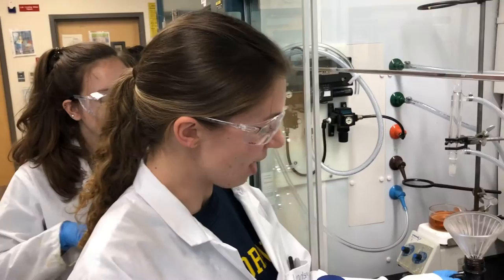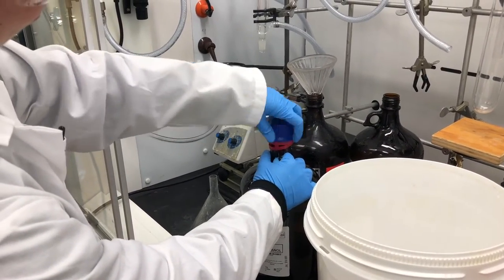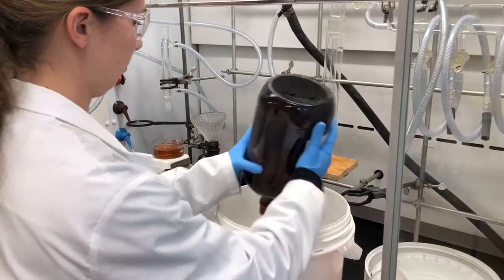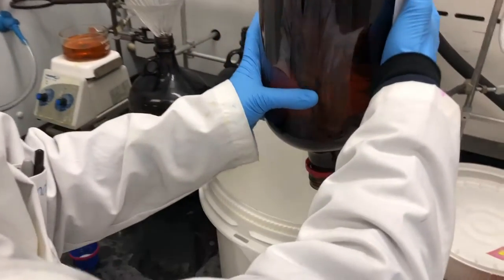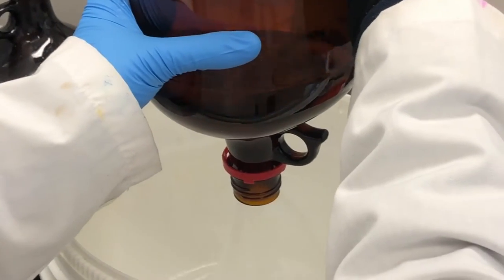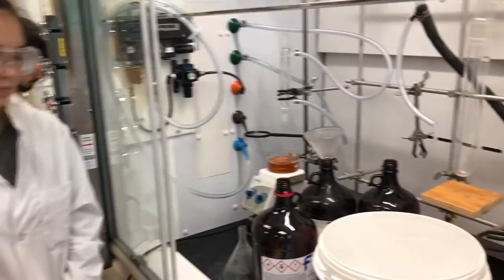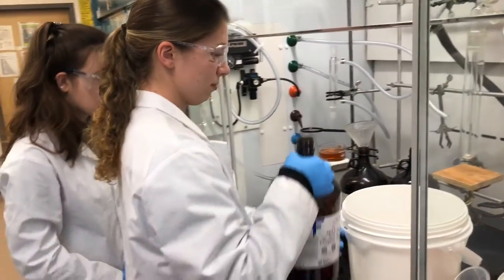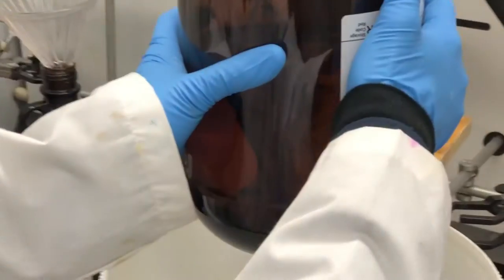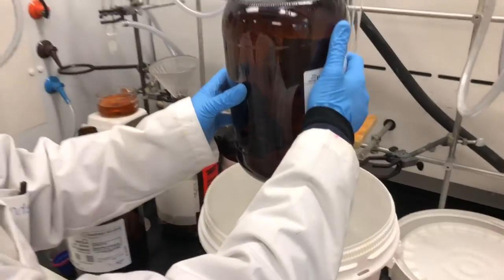Next it's time to add our isopropyl alcohol. By swirling the bottle it prevents any backsplash — it allows the air to come up slowly by creating a whirlpool inside the bottle.